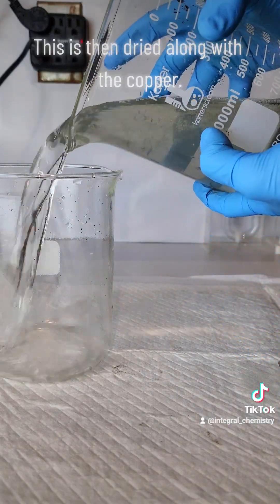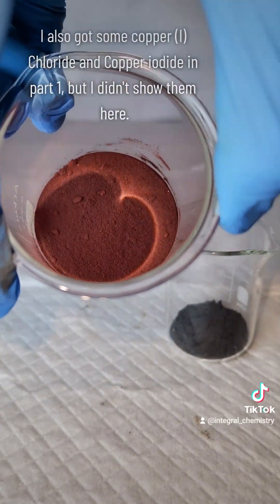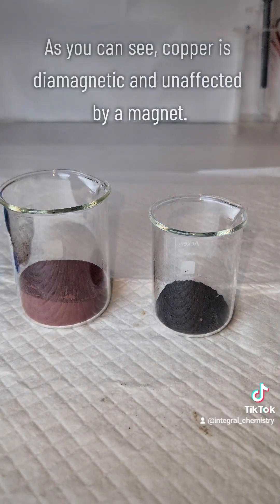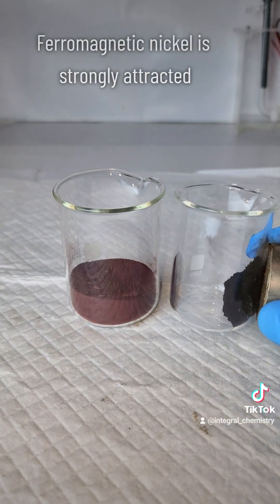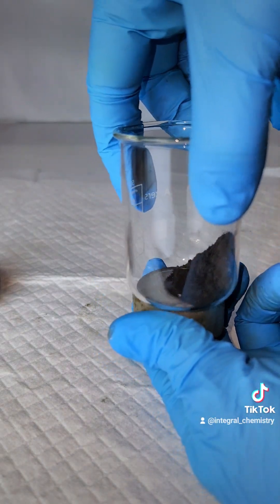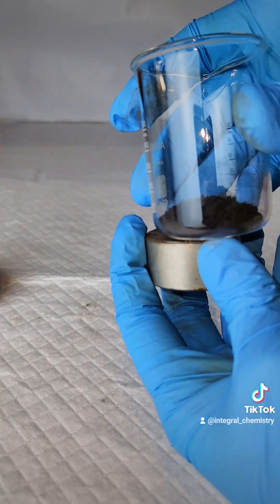This is then rinsed one final time before I separate off and dry my nickel — and at this point I'm completely done. I don't have a percent yield for this process. Part of that reason is because I lost a lot of copper making copper chloride and copper iodide in part one. However, the biggest reason I didn't bother with a percent yield is that I mostly did this as a proof of concept, as I did a lot of reading online and couldn't really find any concrete sources regarding a process for the separation of copper and nickel from solution.